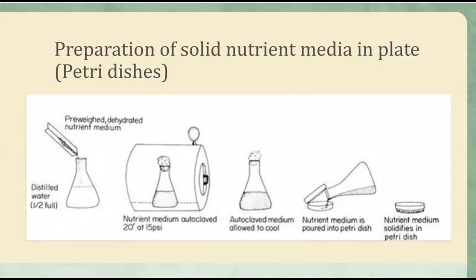Okay, after that, you have to take plastic petri plates. They are already in sealed plastic, and then you have to pour the media into those petri plates. I'm pretty sure you will know this procedure, because this is the starting point of a microbiology student; he should know about it.